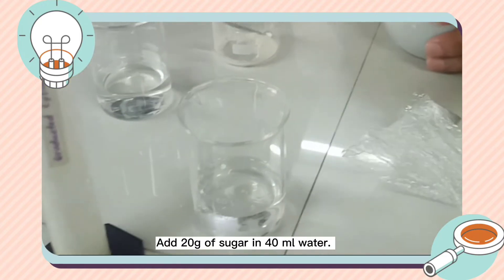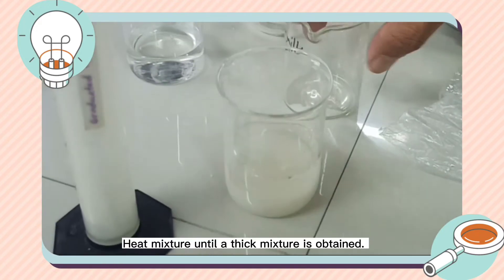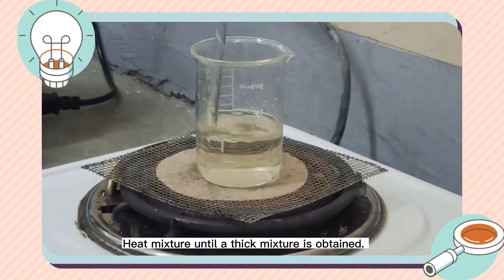Add 20 grams of sugar in 40 milliliters of water. Heat the mixture until a thick mixture is obtained.